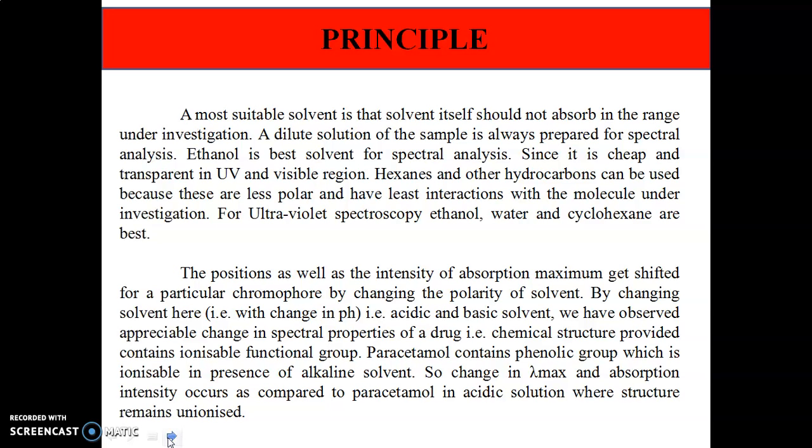Paracetamol contains a phenolic group which is ionizable in the presence of an alkaline solvent. So, a change in lambda max and absorption intensity occurs as compared to paracetamol in acidic solution, where the structure remains unionized.